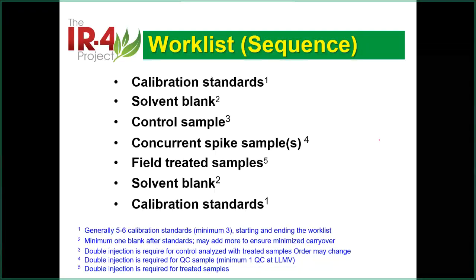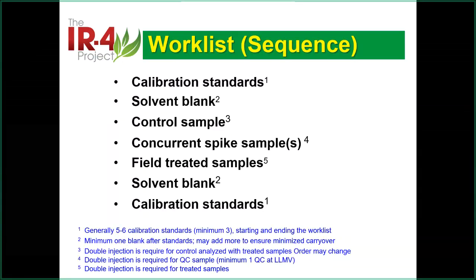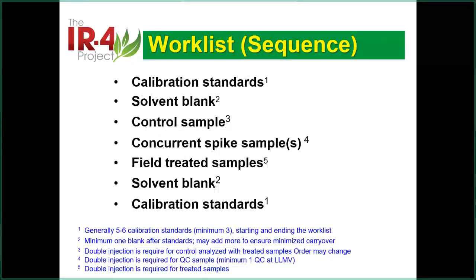You need to have calibration standards before and after. So this is the set we have, and this is the requirement for our work. EPA does not have very restricted regulations or requirements on this, but this is recommended. And for most countries, EU, Canada, Australia, Japan, this is all accepted. So that's okay, you will use that.